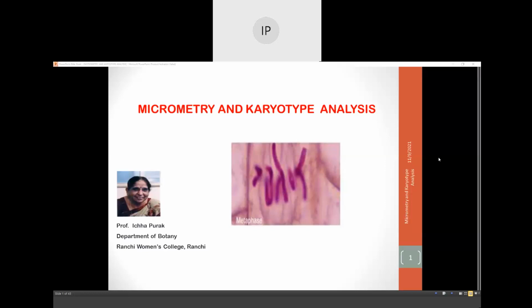Today, I want to discuss micrometry and karyotype analysis with the help of a PowerPoint presentation.